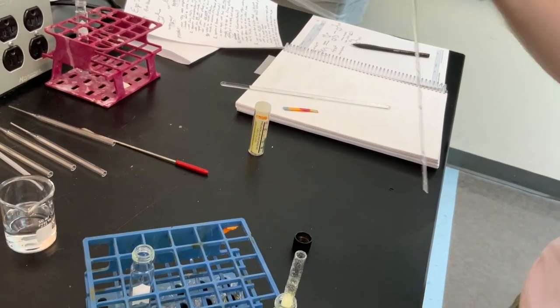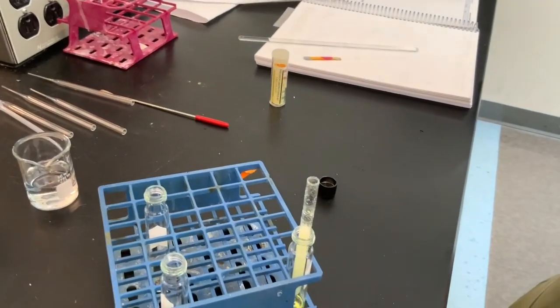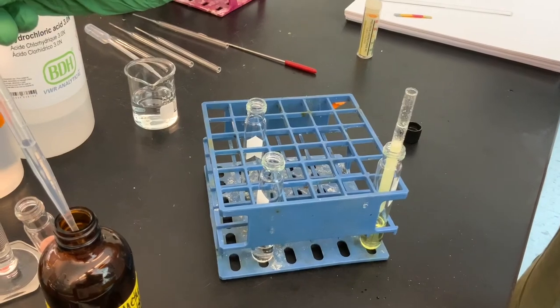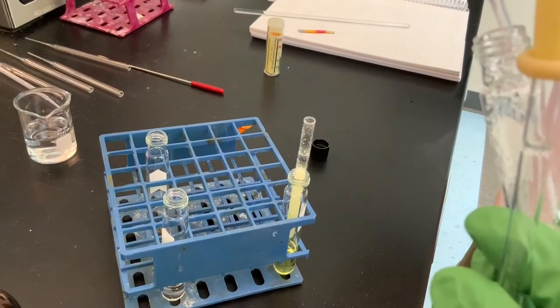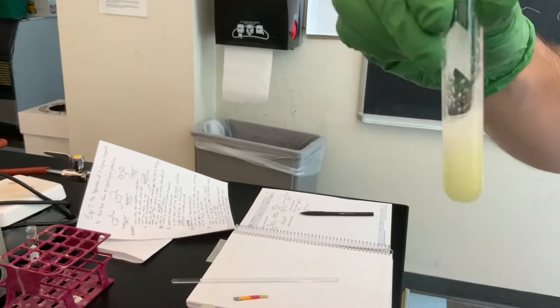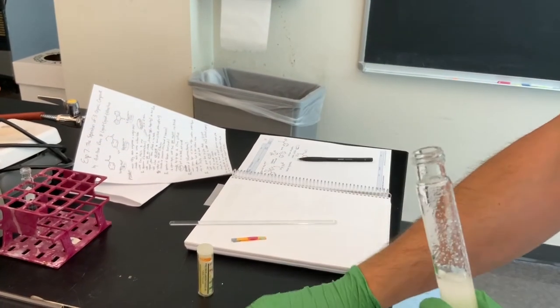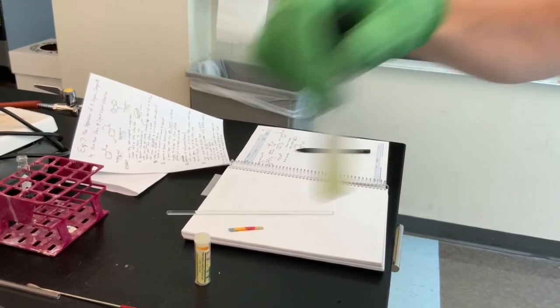All right, that was wash number one. Do another milliliter. Fresh methylene chloride. All right, and so it's even more clear. It's clearing up even more. So obviously we're getting rid of the remaining 9-fluorenone in there. Let's really shake it up.